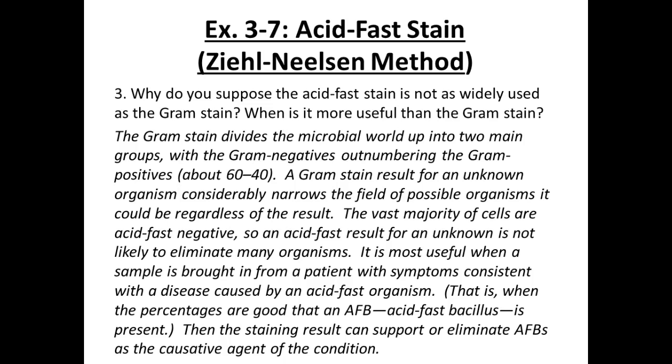Now, if the organism comes out gram positive, and it's rod-shaped, and they're clumping together, what would you probably do next? You'd probably do an acid-fast, because there's some indication you may have an acid-fast organism. The fact that they're rod-shaped, clumping together, and gram positive. And they'll tend to be a lighter purple. The purple of the gram stain doesn't really get into them well because of that waxy layer.